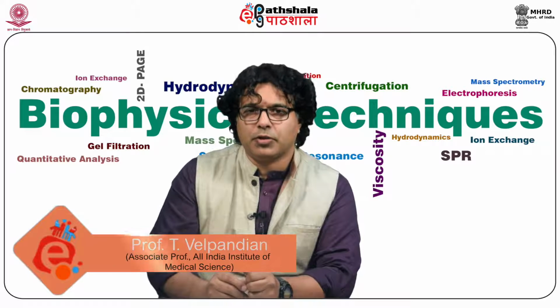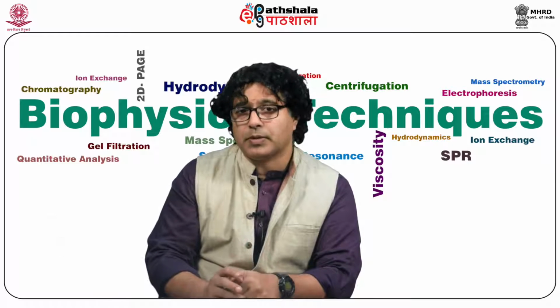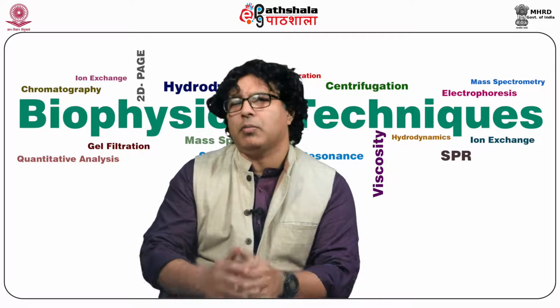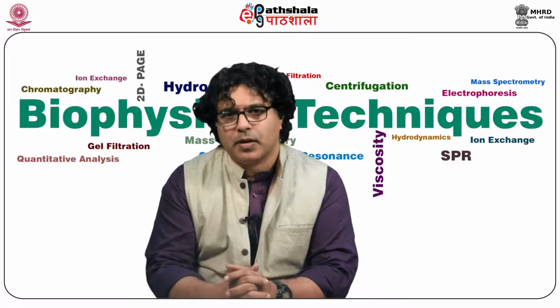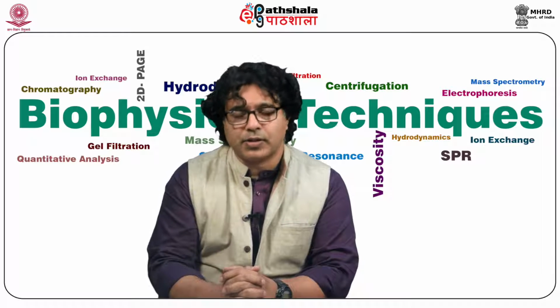Today I am going to talk to you about working with mass spectrometer, especially triple quadrupole tandem mass spectrometer. I'm going to tell you about the working and the other things done. This is for the paper of Molecular Techniques in Biophysics 1.